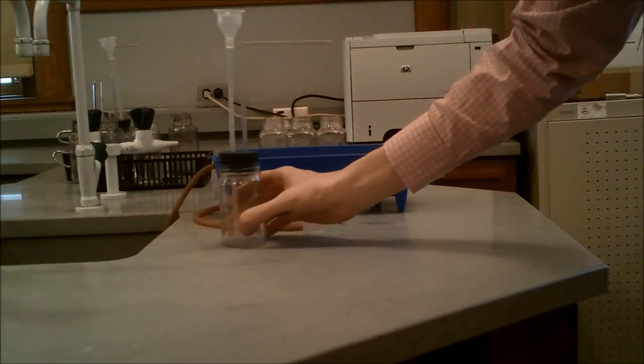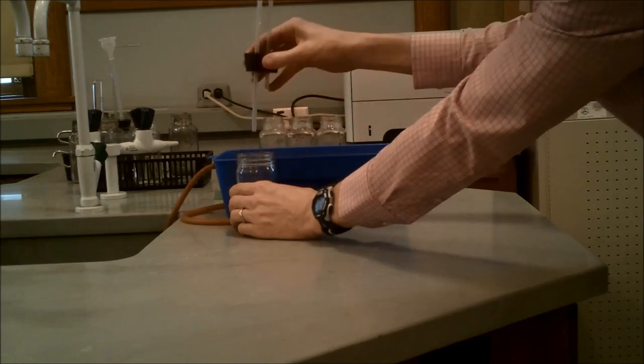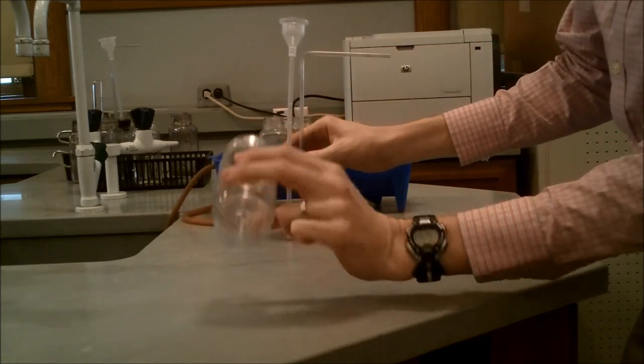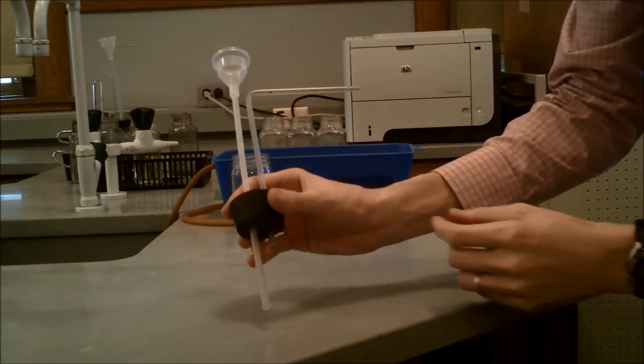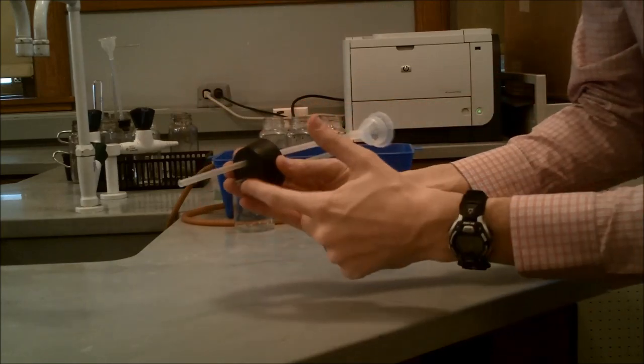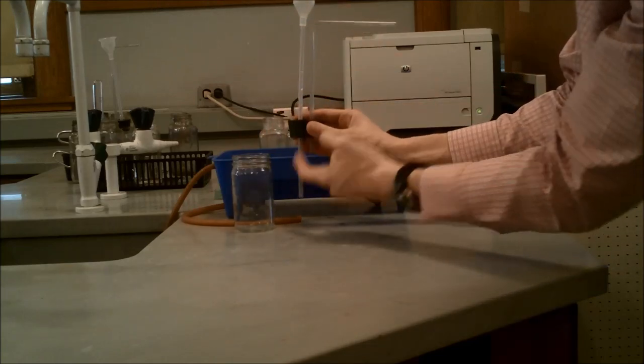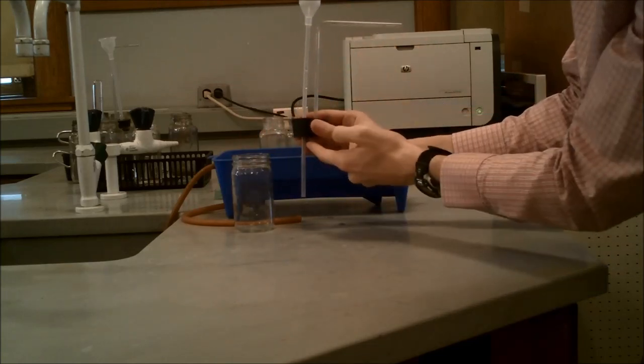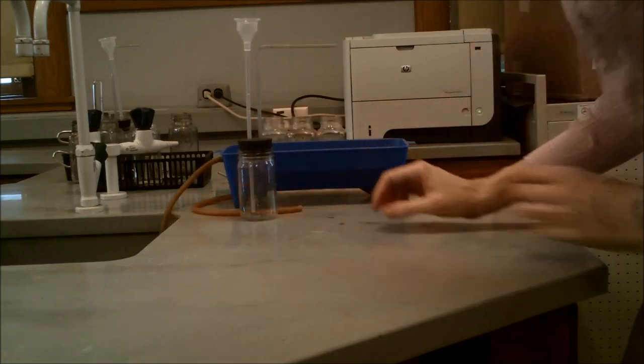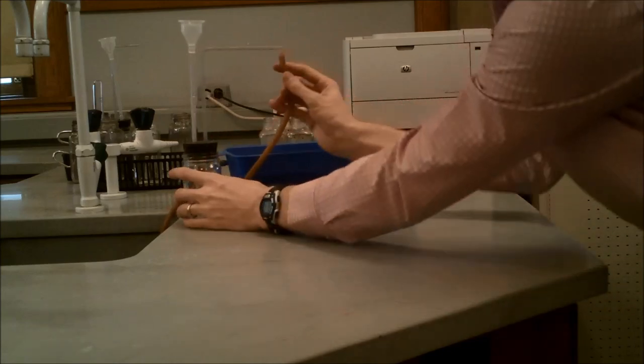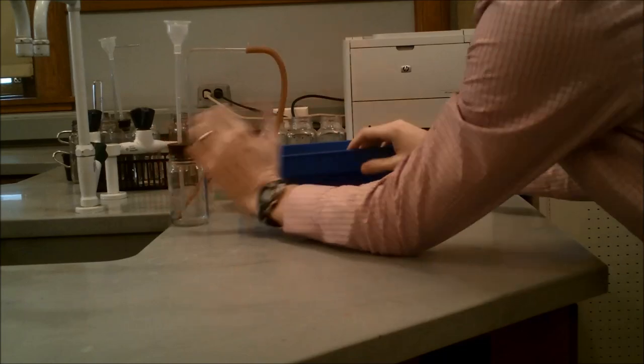The next piece of equipment is the reaction chamber, which has two parts, the cork and the reaction chamber itself, which is the cylindrical jar. The two parts here are two tubes, there's a plastic and a glass. The plastic goes much further than the glass tube down. The plastic is actually called the thistle tube. The glass one will be connected to the tube that goes to the bottom of the trough.